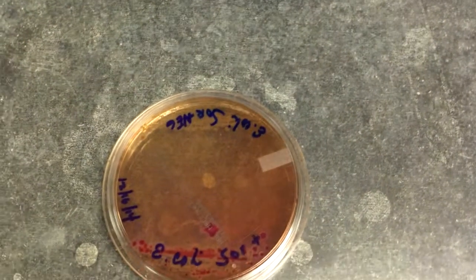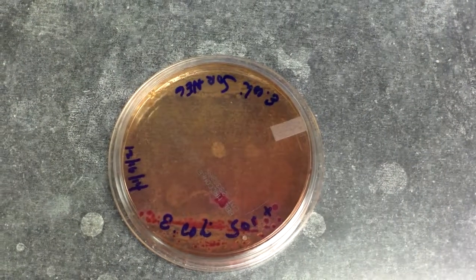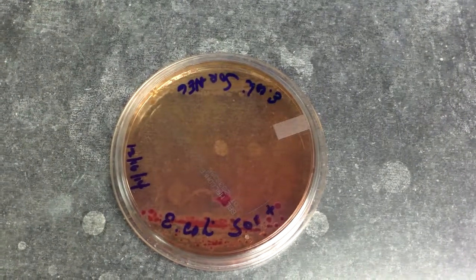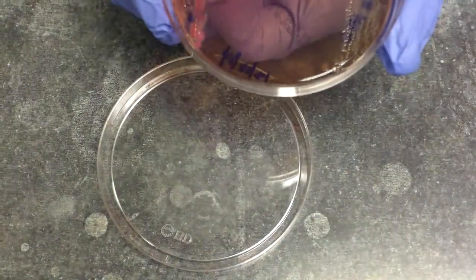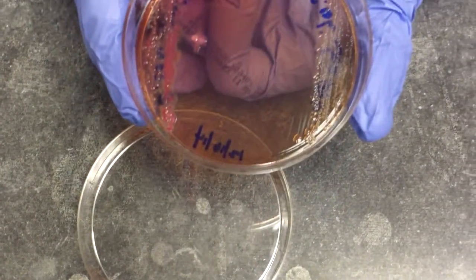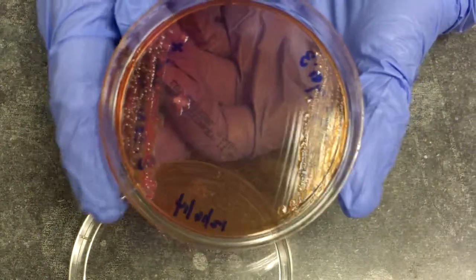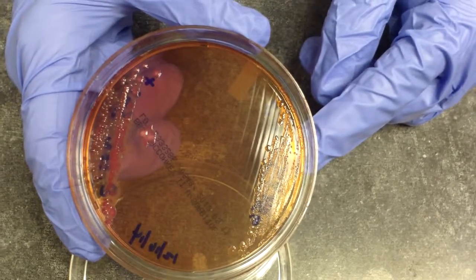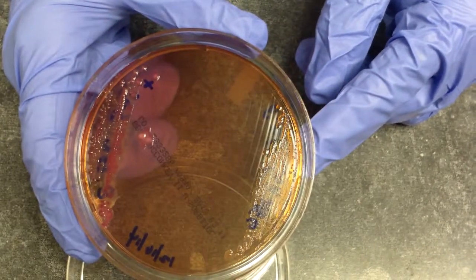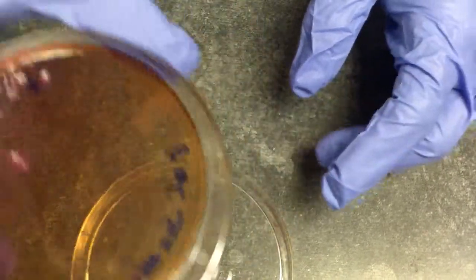Sorbitol MacConkey is also a differential medium, and it helps us to identify E. coli O157:H7. On the MacConkey sorbitol agar, if the E. coli utilizes sorbitol, it will turn a pink color. If it is a non-sorbitol fermenting organism, such as the E. coli O157:H7, it will be a clear colony.